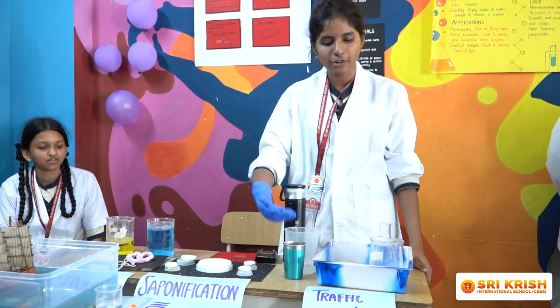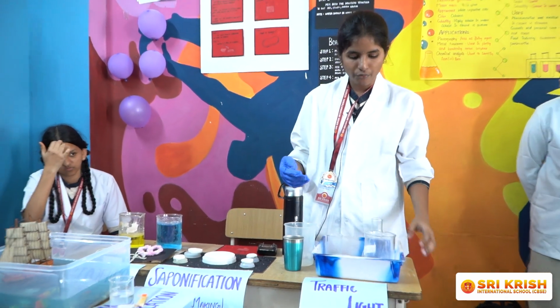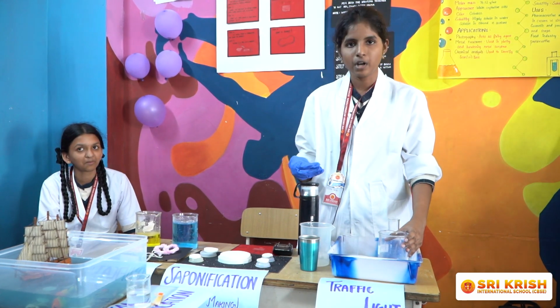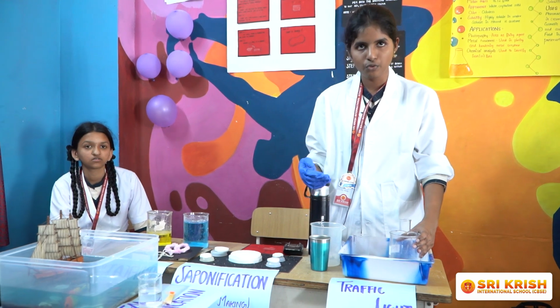I am going to carry out the traffic light experiment. For this experiment, we need two solutions. The first solution is prepared by using 150 ml of hot water, 5 gram of NaOH and 3 gram of glucose.